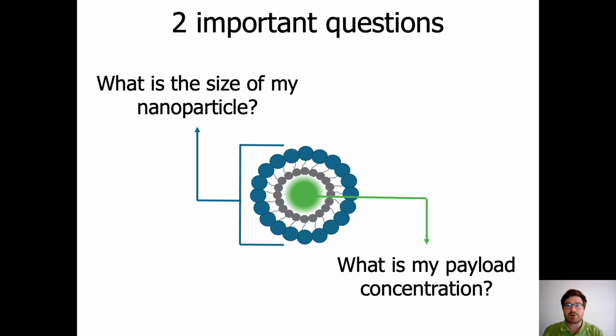There are a lot of properties that are important during development of nanoparticles. What particle shape you want and what size they should have, which lipids or other components will be used and in which ratios. Choosing your API payload, choosing potential surfactants, what charge the particle should have, in which buffer, and which pH it should be in. Now, once the particle is made, two important questions come up as well. What is my particle's payload concentration, and does it have the size I want it to have?